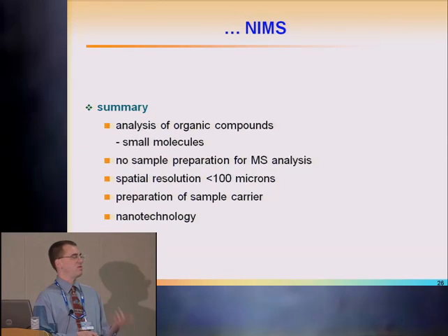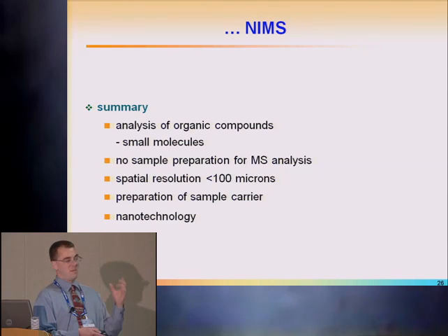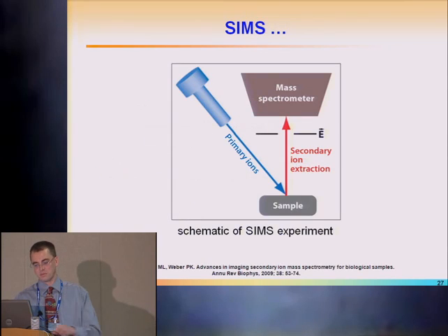Again, no sample preparation for mass spec analysis, and spatial resolution is dependent on the laser, of course, less than 100 microns. But there's extensive preparation of the sample carrier itself. But I think here nanotechnology moving forward will provide us with more sample carriers.